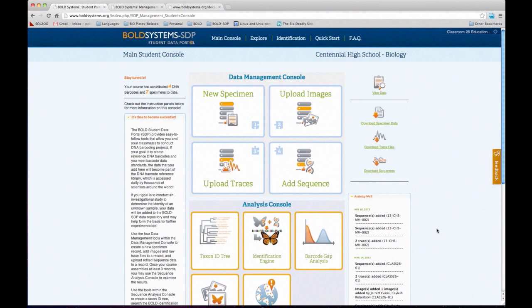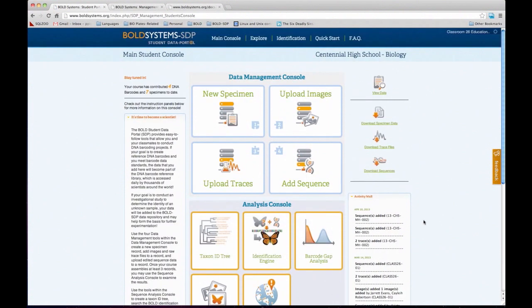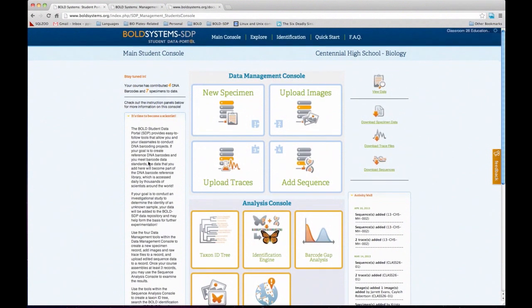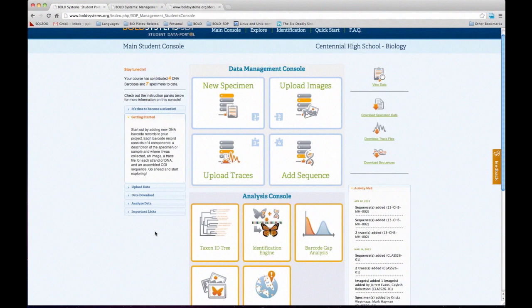This is basically how your classes would log in. When you register an account — and we'll go through that process a little bit later — you get a username and password for your classroom, and that information is shared between all students in the classroom. This is basically what they're going to be seeing when they log in: this is the student console. It has instructions on the side of how to upload data, how to get started, how to download data, and it has the main tools that students are going to be using.